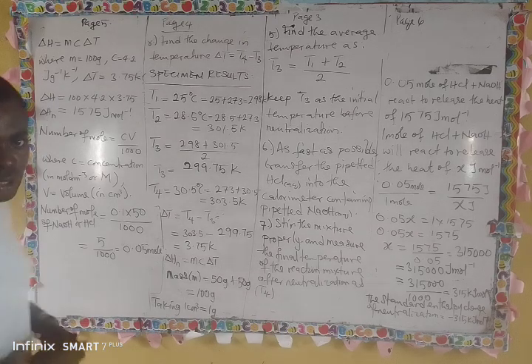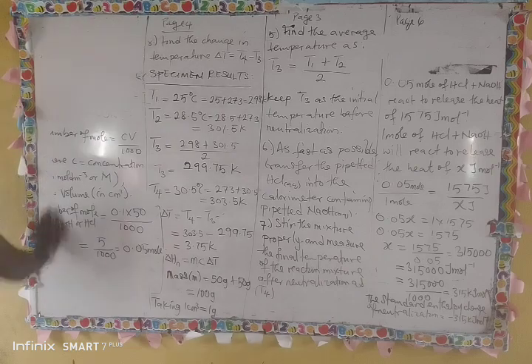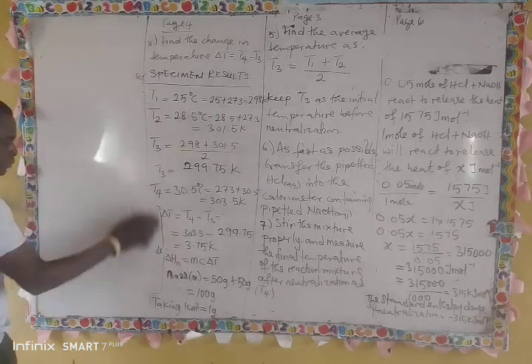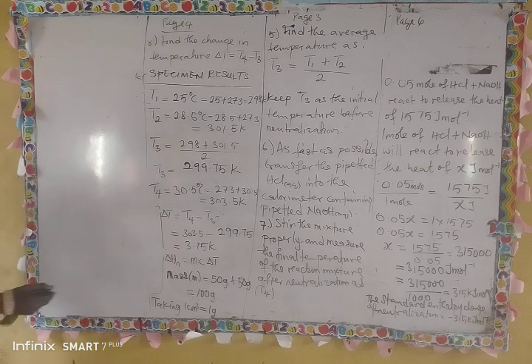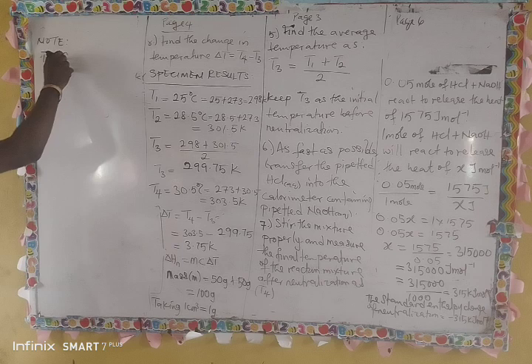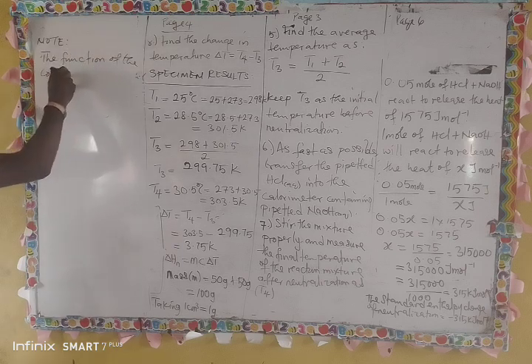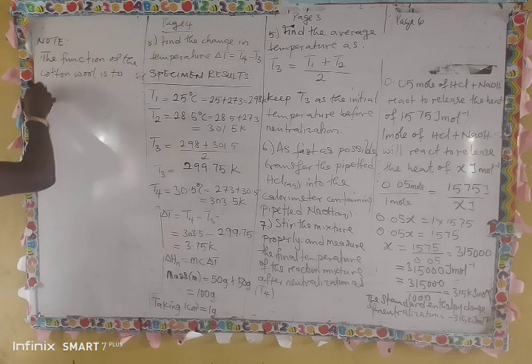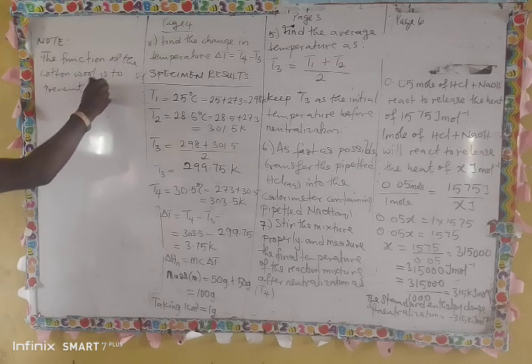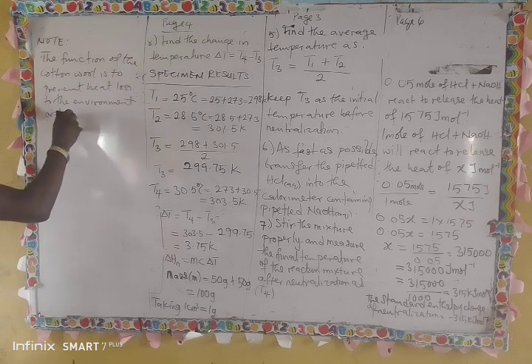practically. But take note, caution. Let's check something to be very careful of. Note the function of the cotton wool. The function of the cotton wool is to prevent heat loss to the environment or heat gain from the environment.